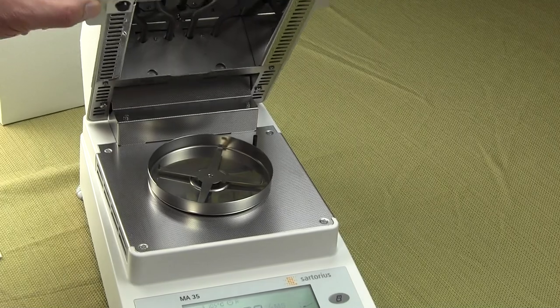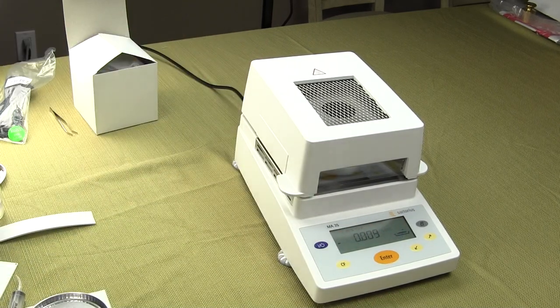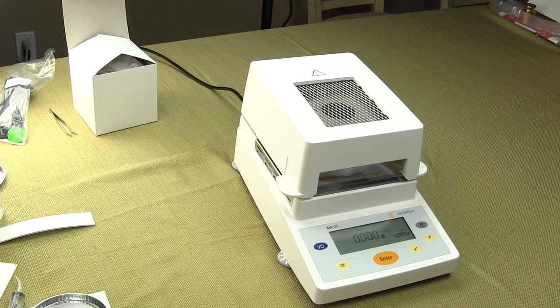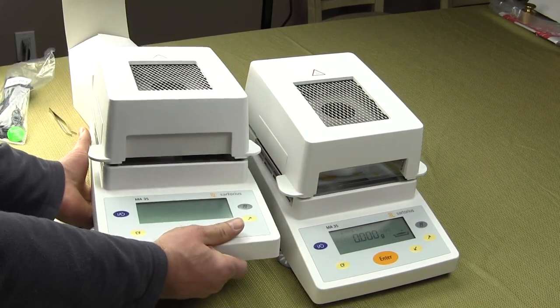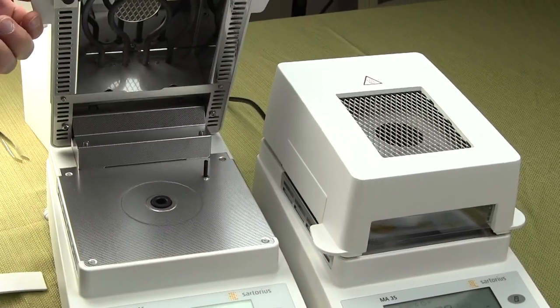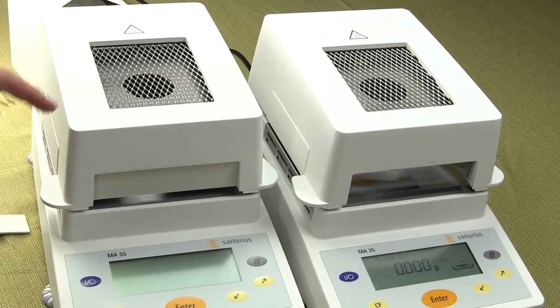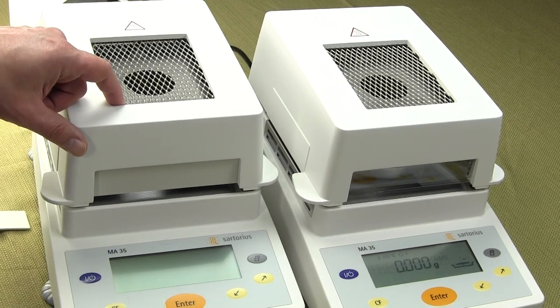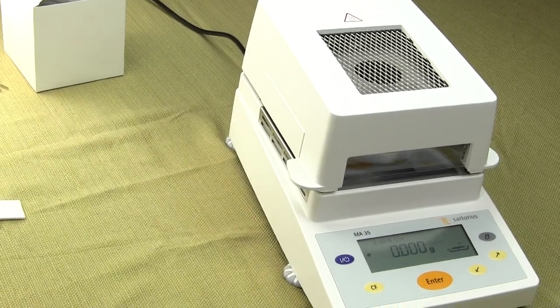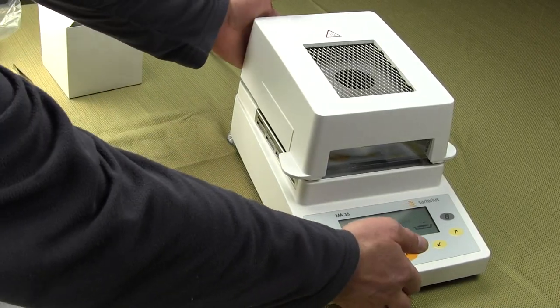So this is the non-FDA version. I have another unit here — this is the exact same unit but with metal blanks, so there's no glass in the front. Sartorius would call this the MA35 V2 version, or the FDA version. We're going to demonstrate the non-FDA version since we typically sell more of those.